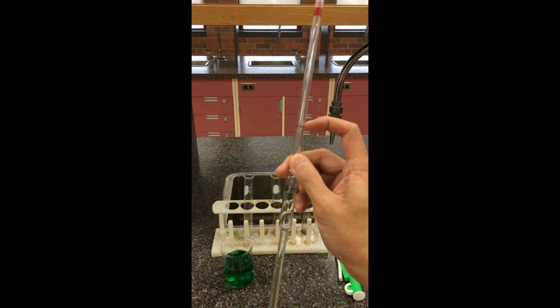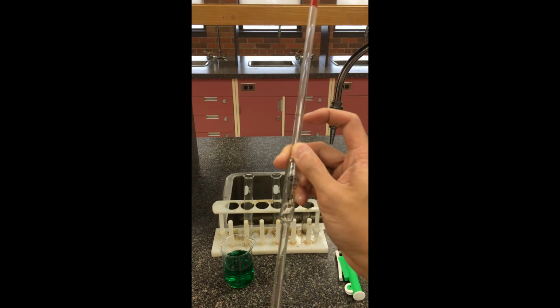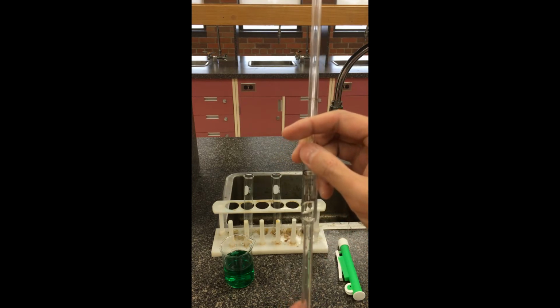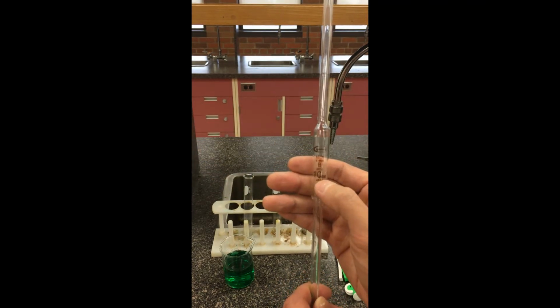There is one line on the pipette that, when the solution is exactly at this line, it's been calibrated to 2 decimal places. So for a 10 milliliter pipette, the solution would be read 10.00. Sometimes the glassware itself would quote what the manufacturing error is, and right now, if you can see it well enough, this one says 0.04 plus or minus.